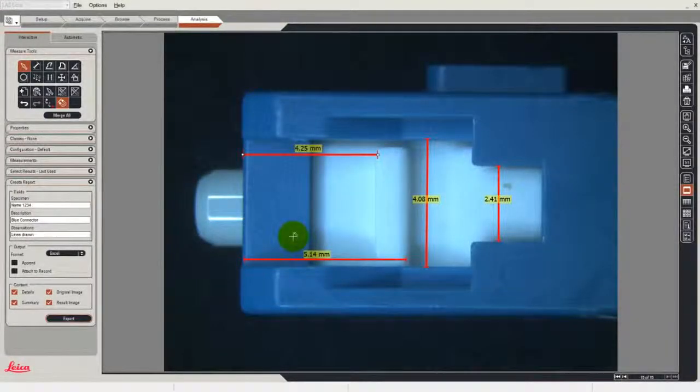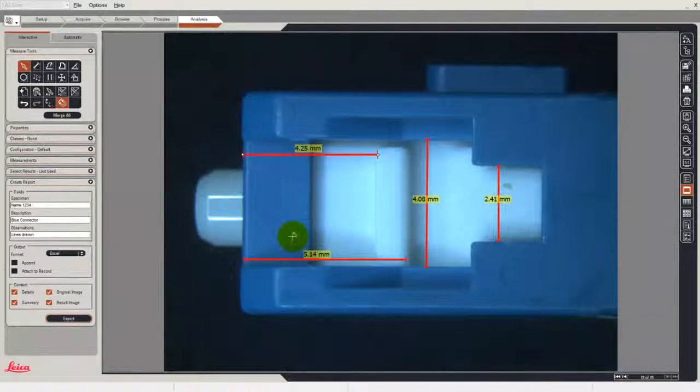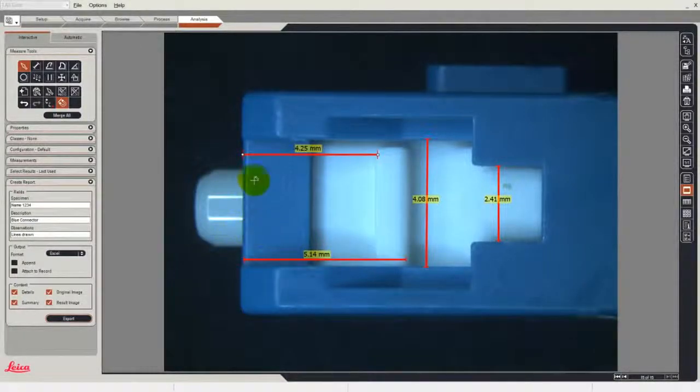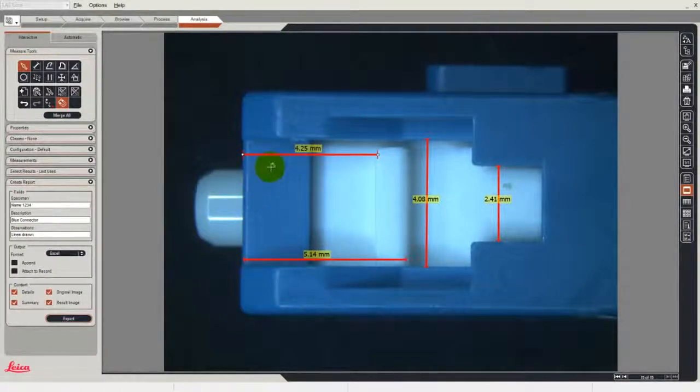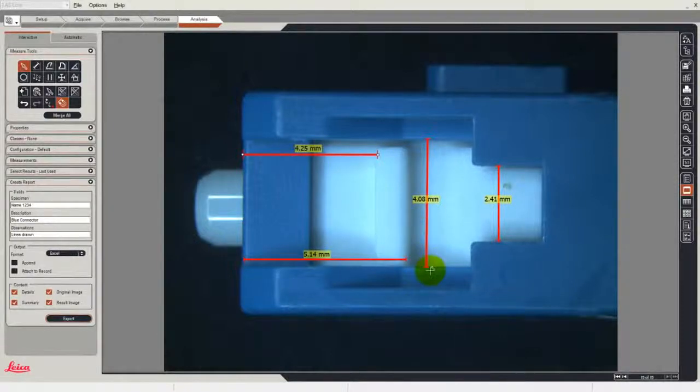In this video, we'll show how easy it is to create a report from the interactive measurements that you've made. The reports in this case are going to be made into Excel. You can see that on the screen, I've measured a number of lines on this connector image.